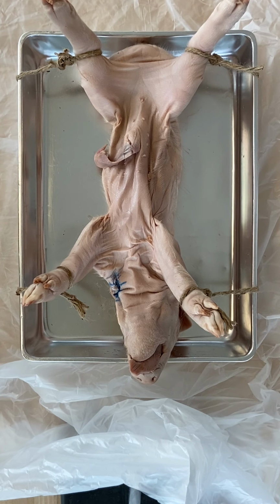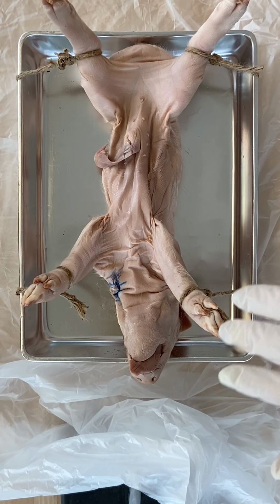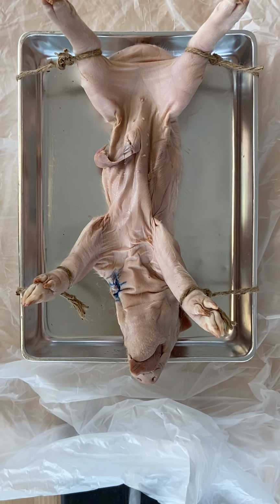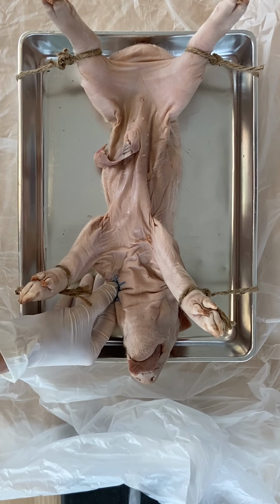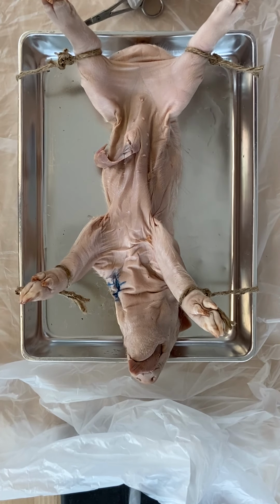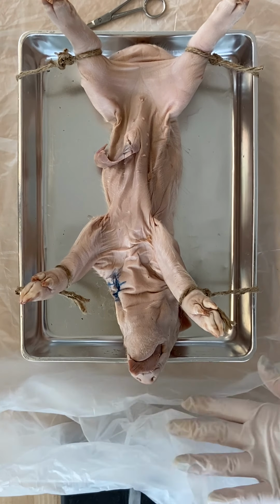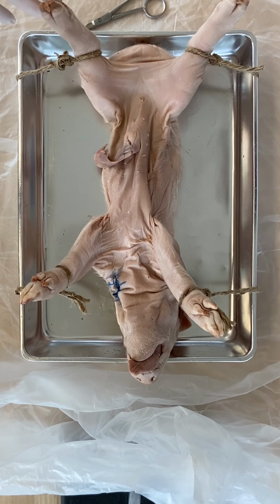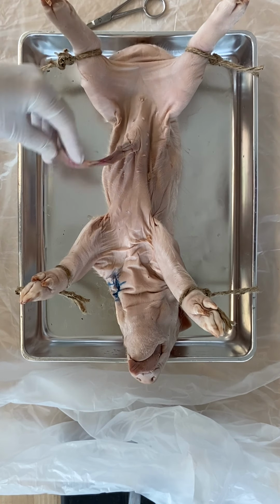All right, here we are with pig dissection. And this pig, Mrs. Martin, what's special about this piggy? This pig has been double injected with a blue dye for veins and a red dye for arteries. Okay, so we should be able to see a little bit more inside. We have a male pig. This is the umbilical cord.